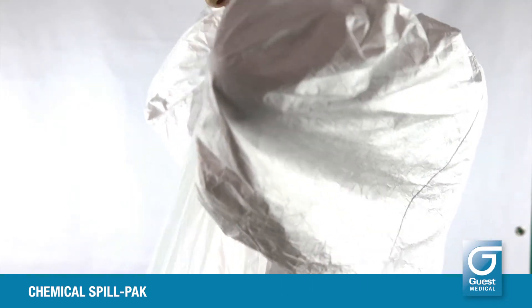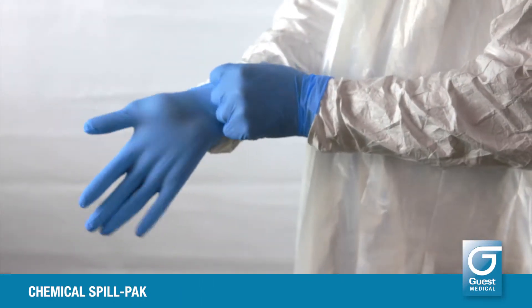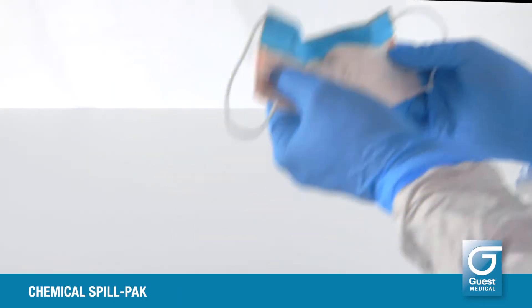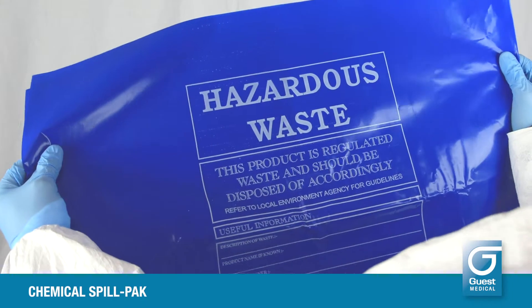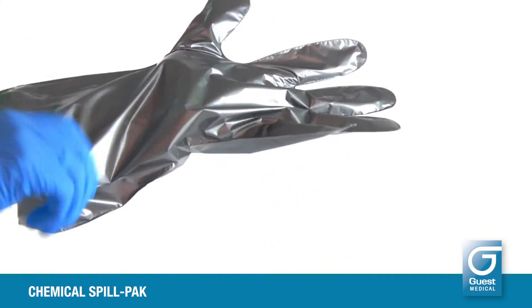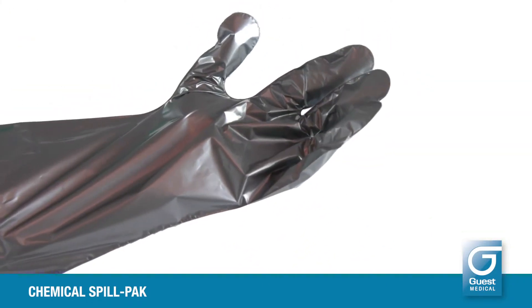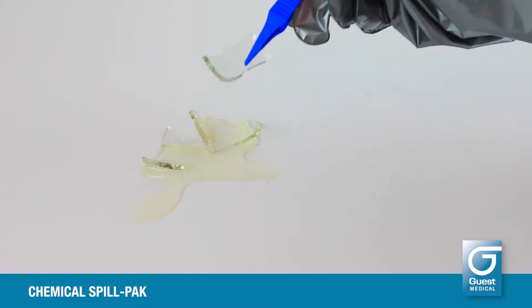Always wear the protective apron, gloves, and face mask provided in the pack. Set up the hazardous waste bag as close to the spill as possible. Put the chemical resistant gloves on over the nitrile gloves.